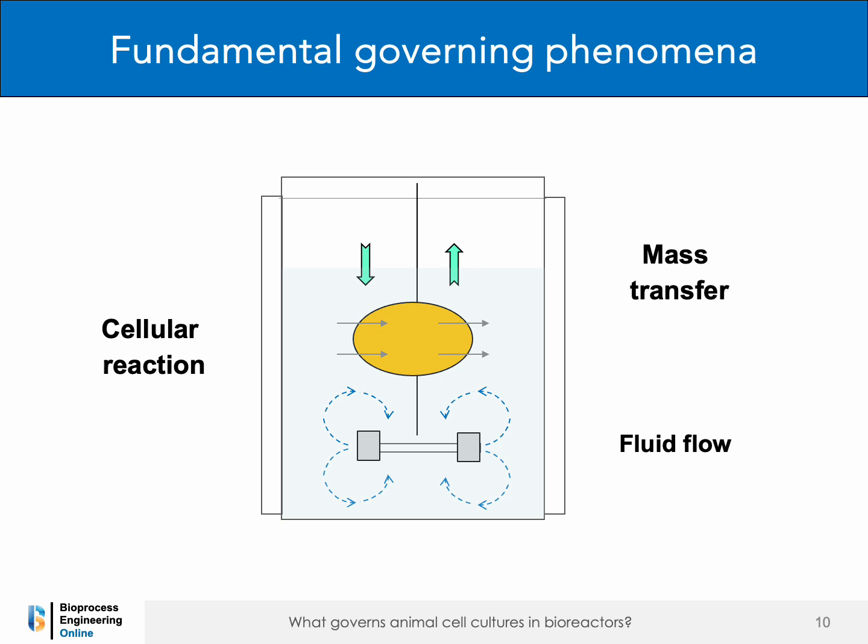In addition, physical phenomena play a critical role in shaping culture dynamics. Mass transfer, particularly the rates at which oxygen and carbon dioxide are exchanged between the gas phase and the culture medium, and fluid flow, the circulation and mixing of liquid elements within the bioreactor.